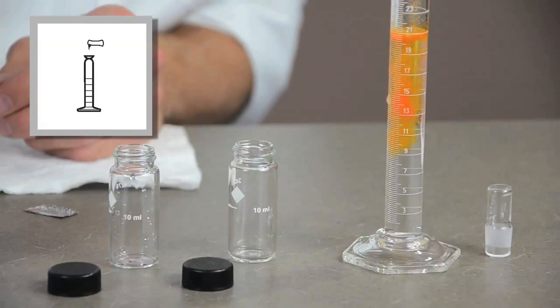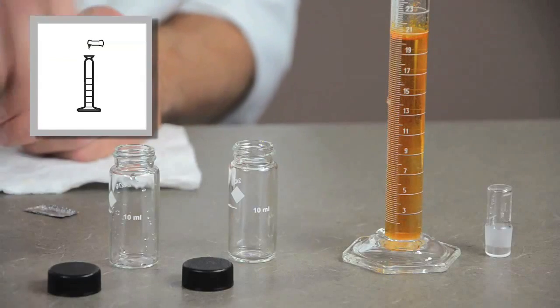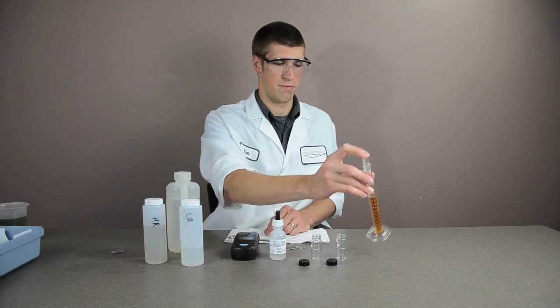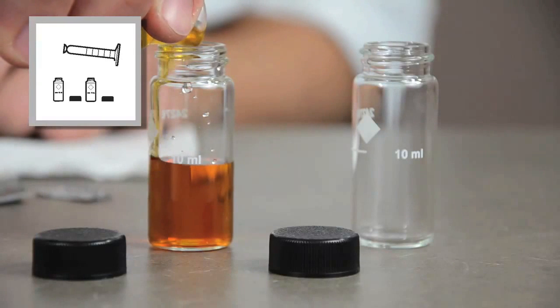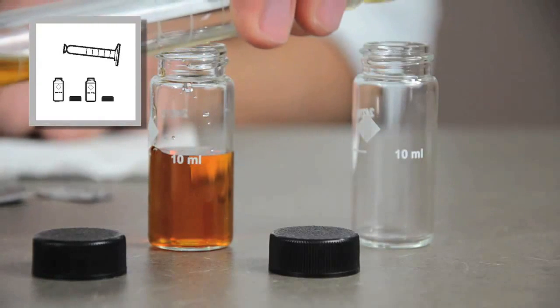Add the contents of one molybdenum 1 reagent powder pillow to the cylinder. Stopper the cylinder and invert. Split the sample by filling two 10 milliliter sample cells to the 10 milliliter mark.